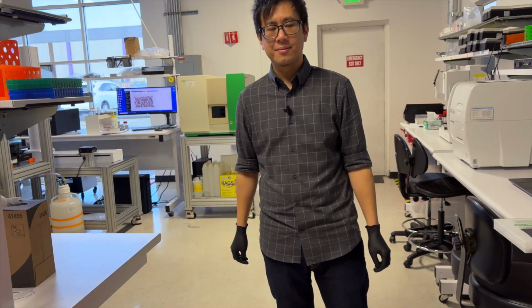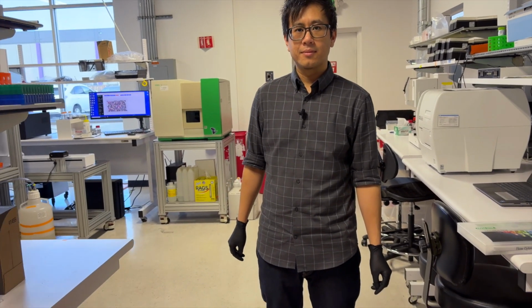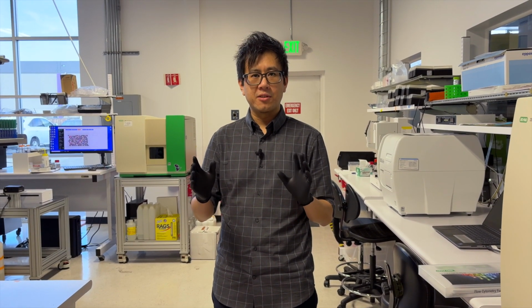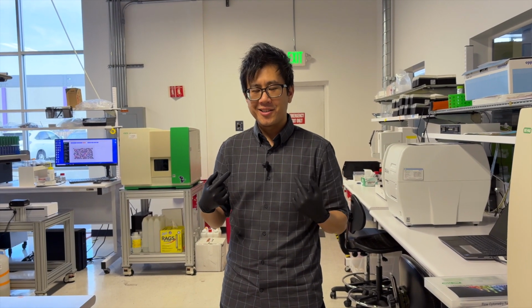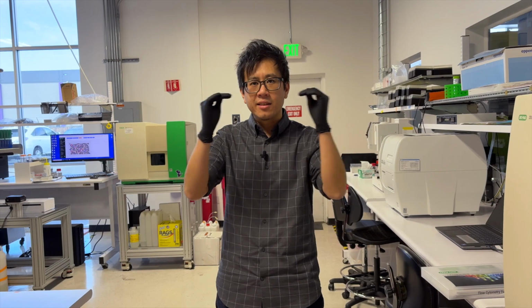As you talked about the modularity of your lab, is there a similar sort of framework that you're using in your LIMS as you plug in new equipment, for example? Yeah, that's an interesting question. I think there's always a bit of play between modularity and ease of use. Engineers, and I can say this because I'm an engineer myself, are always guilty of trying to put things in a nice, clean little box.